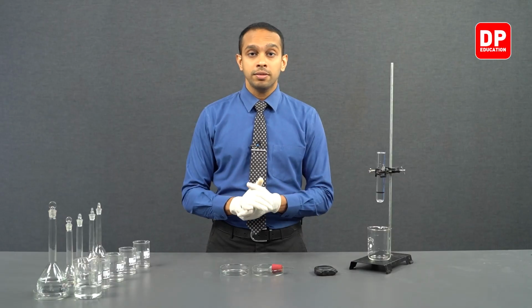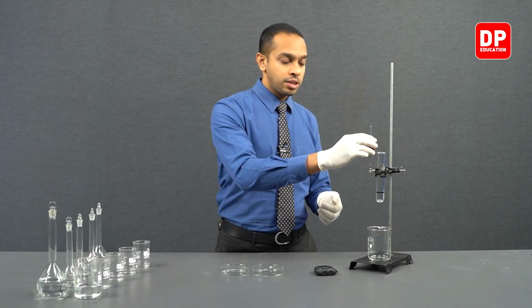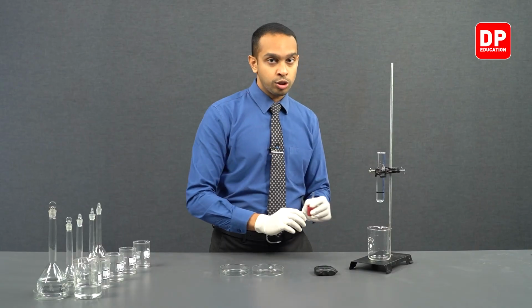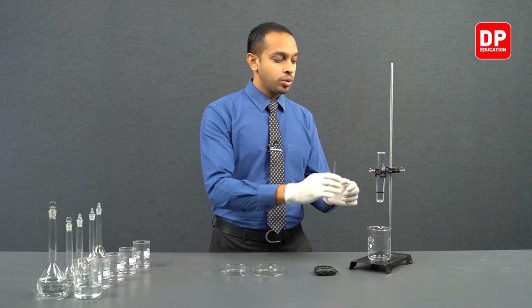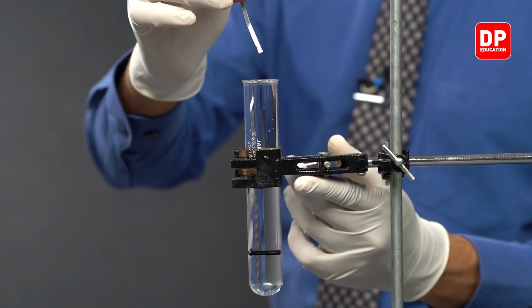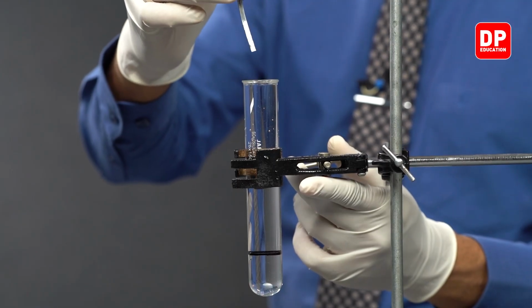And after filling it all the way to the top, you can place this rubber stopper, turn it upside down, and start your stopwatch. So we are going to be placing this magnesium strip here. As soon as we do that, we'll turn it upside down and turn on our stopwatch.